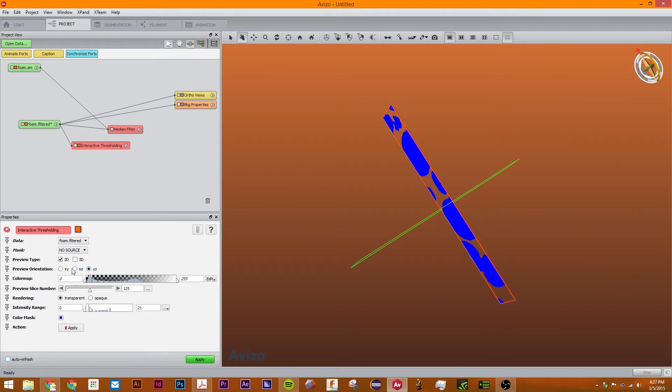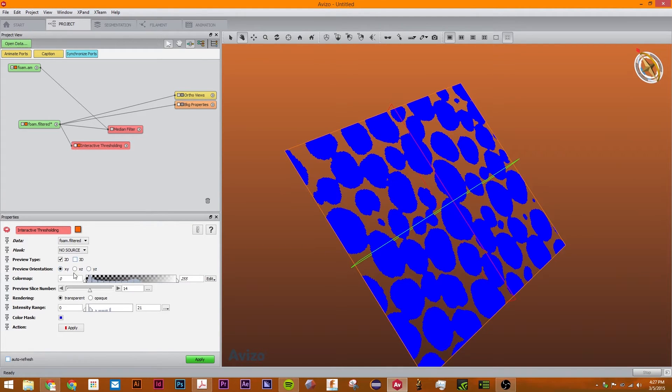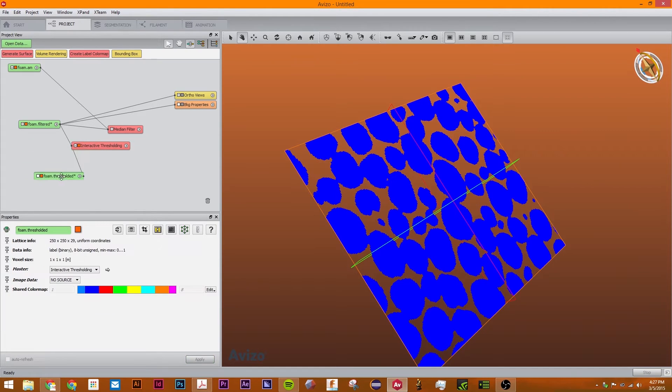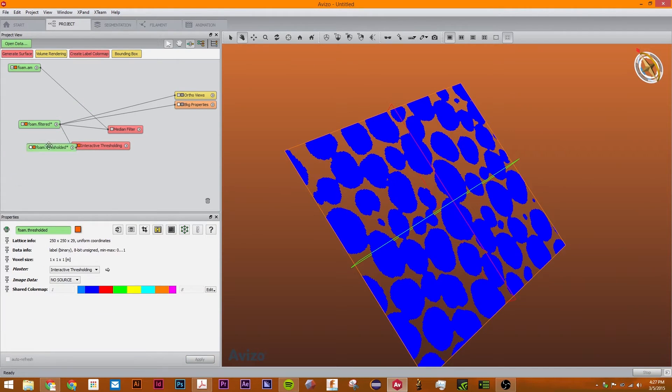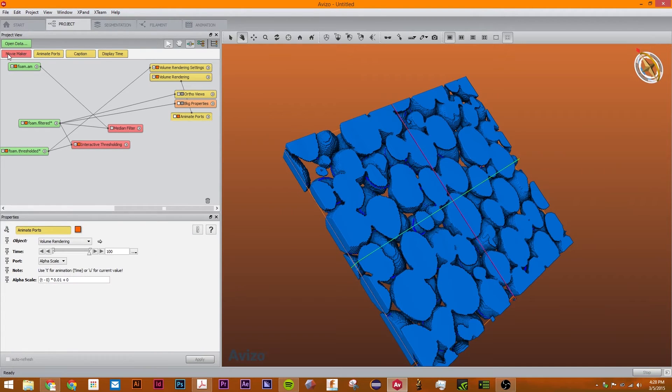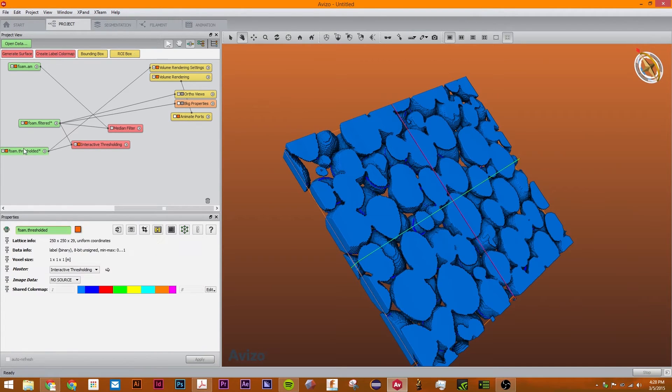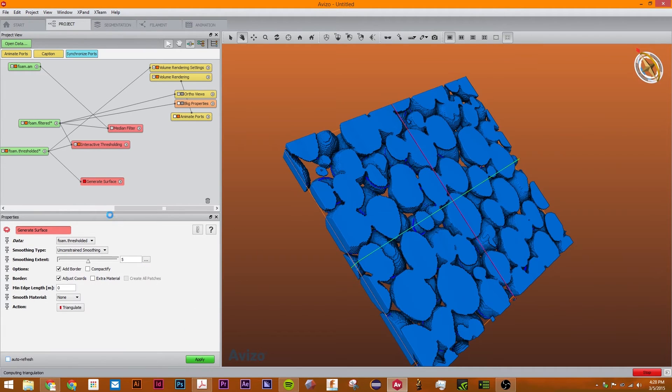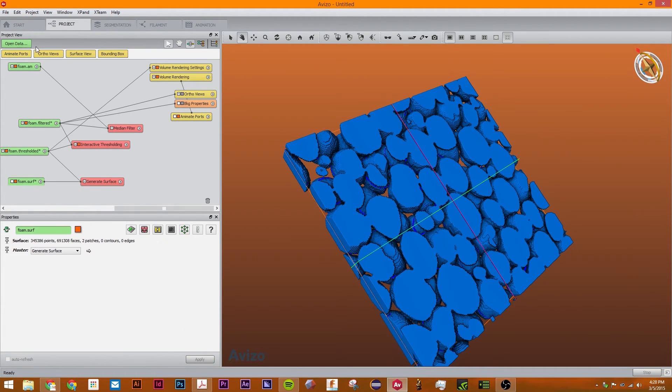You can change the slice. The next thing we're going to do is just click apply and now we have a thresholded binary image which we can easily create a volume rendering of. We can generate a surface from it. Just click apply and now we have a surface.